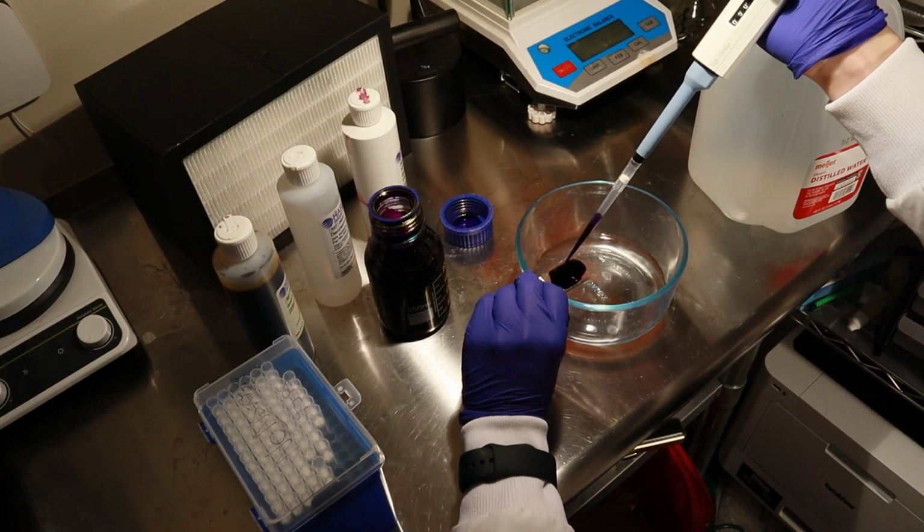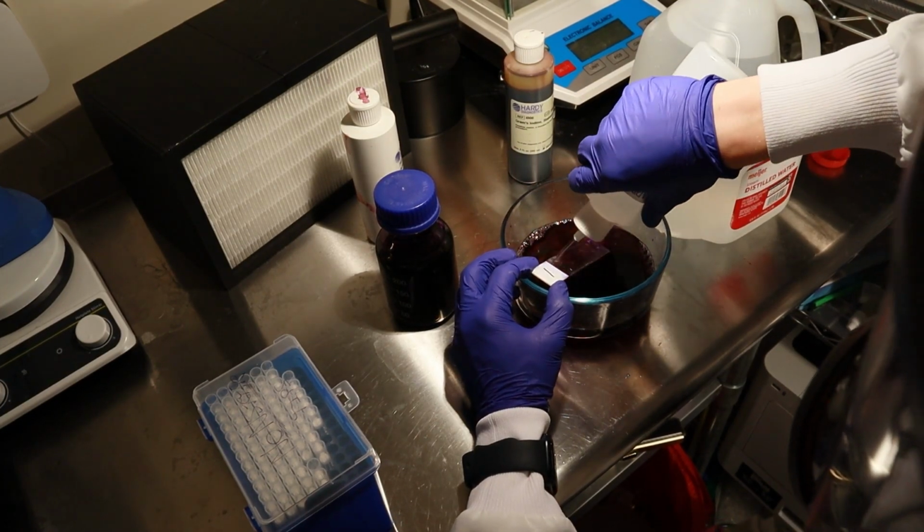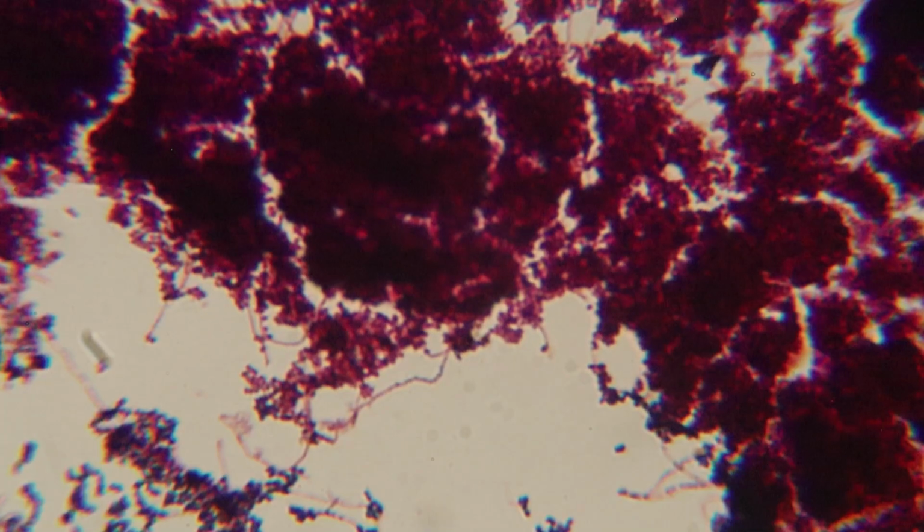I repeated the Gram stain, but now did the Gram's iodine and crystal violet stain for twice as long, and decolorized for half as long, and the result was still inconclusive. Some spots were appearing gram-positive, and some gram-negative. So what's going on? I assumed that my crystal violet had just gone bad, so I ordered a new one and I moved on to the malachite green stain.